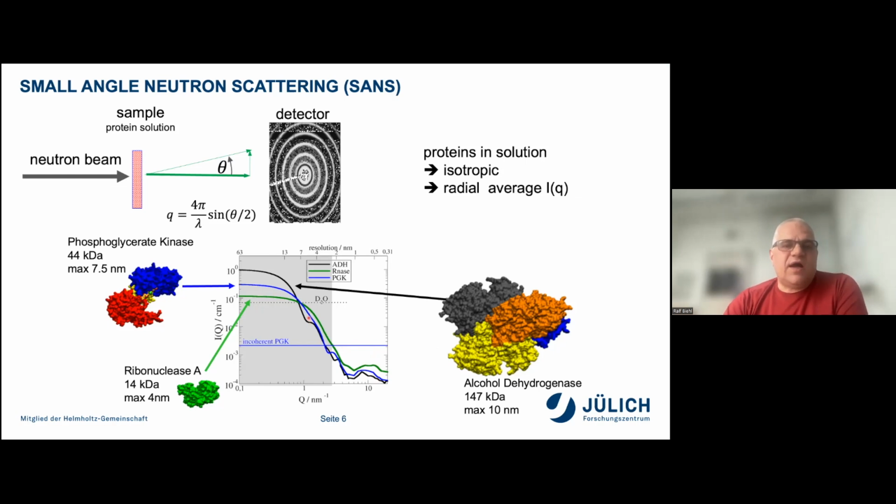The difficulty for us is in general that these calculations are done for 10 milligram per milliliter, so our D2O background is at this level here, which means that if we want to see more details of this mid-range Q range, where we really see shape, we need to increase concentrations to get better data.